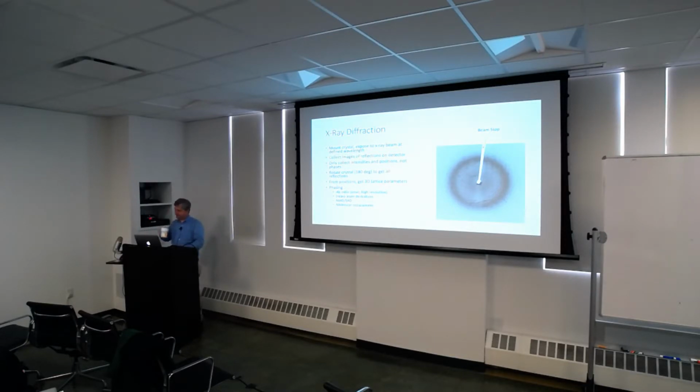Barely enough. Yeah, Friedel symmetry, right? So then you only have to go 180. Right. It should be complete, but never is.